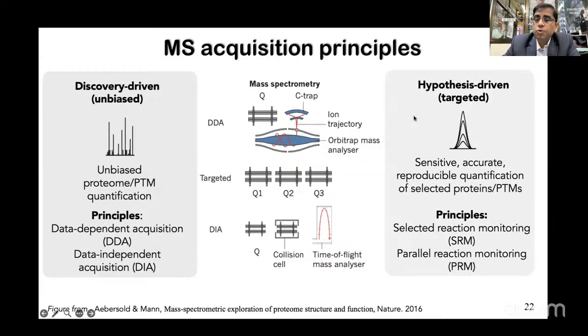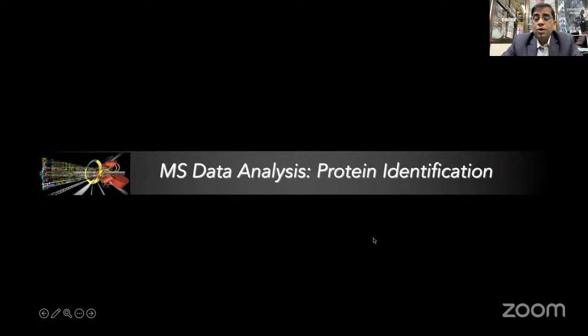Additionally, once you know your target and you want to validate it, then you are going to utilize the targeted proteomics-based workflow using the triple quadrupole or the Orbitrap-based configuration. So this again gives you a variety of things that can be done using these mass spec configurations, which we just showed you. Now you are able to generate some data from these mass spectrometers, how to identify the proteins, right? So that's the next thing you want to learn.